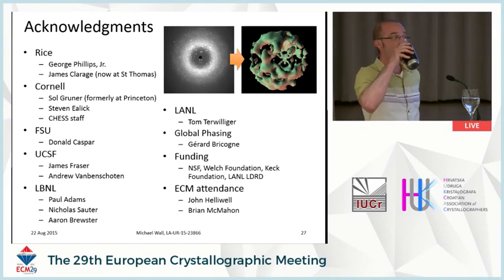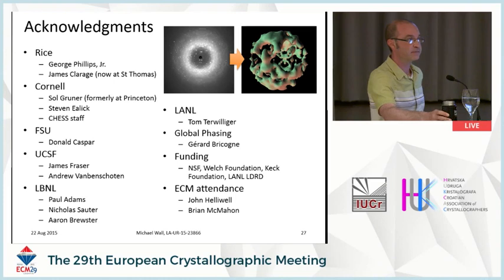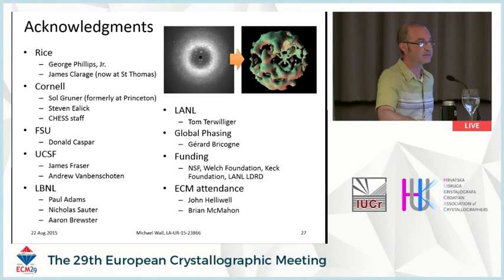Very nice, Mike. I have a question for you and for Vladek. So you mentioned the possibility of using a better understanding of diffuse scattering to get a better measurement of the Bragg peaks. My question is, is it really plausible that the understanding of the details of the shape of the diffuse density would be sufficiently structured in the region of a Bragg peak that it would actually be better than the current algorithms for just taking an average and a plane of density around the Bragg peak?